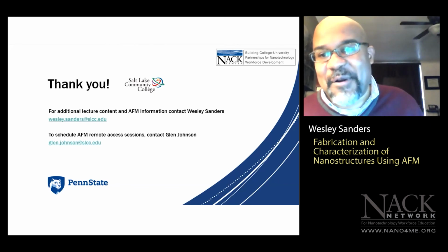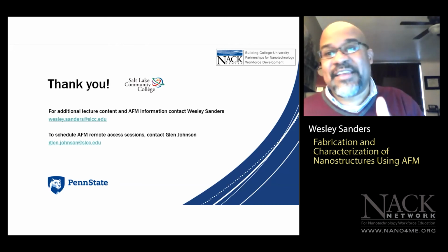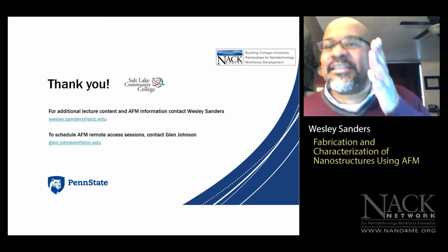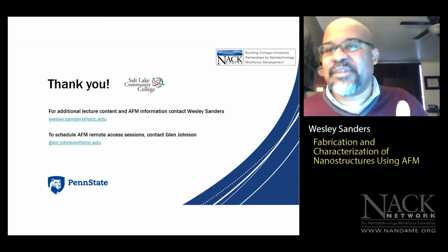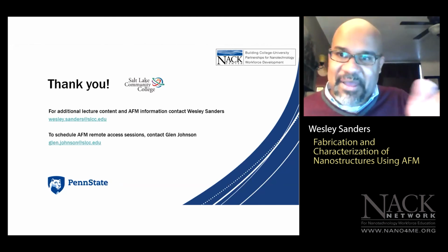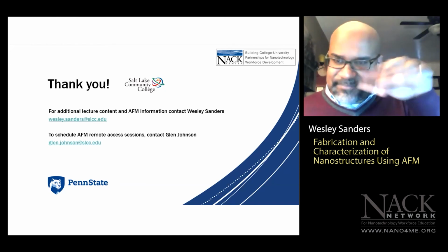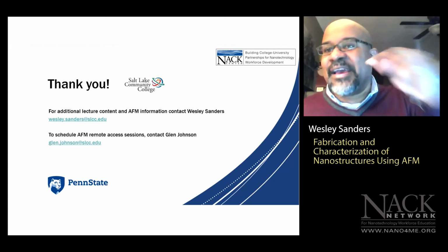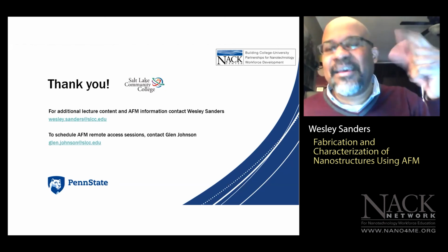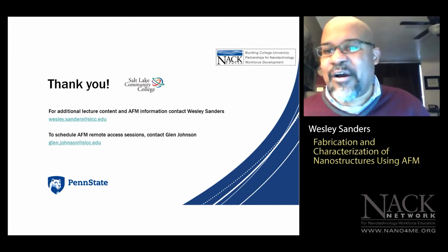What we do, well, on our campus, short answer, no. But it may not directly answer your question, if you're solely interested in studying the magnetic properties of materials, then there's a flavor of AFM that allows you to do that. It's called magnetic force microscopy, and it has a specialized tip that can image nanoscale domains. I know that hard disk manufacturers like Seagate use MFM to characterize their hard disks.